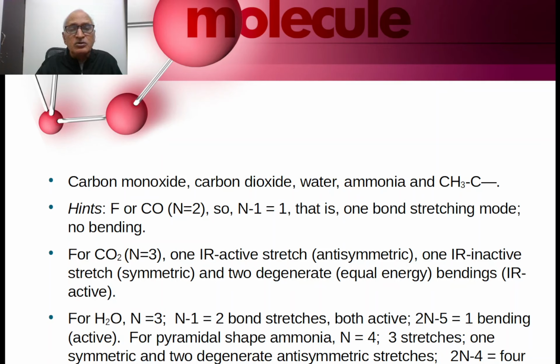For molecules containing more than 3 atoms, bendings could be in plane and out of plane. Here, note down, mathematically, if there are only 3 points, they can never be non-planar. They must always be planar only. So if the number of atoms present in the molecule is 3, out of plane vibrations cannot take place. When the number of atoms present in the molecule is more than 3, then basically 2 types of bendings take place. One is called in-plane bending, which is of 2 types: scissoring, rocking. And the other one is called out-of-plane bending, which is again 2 types: wagging and twisting.